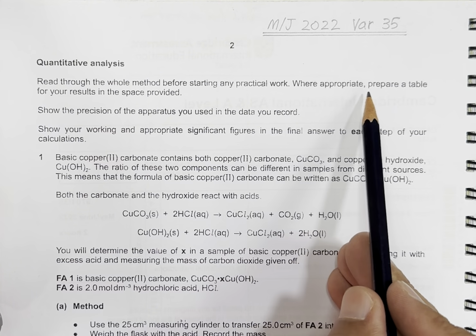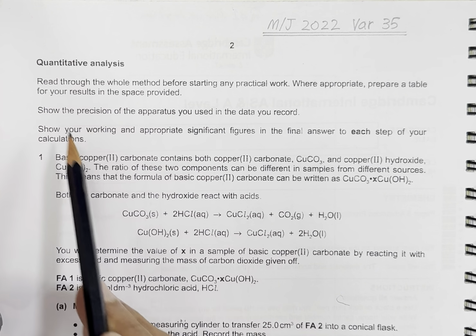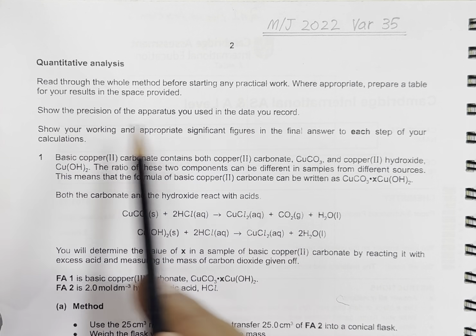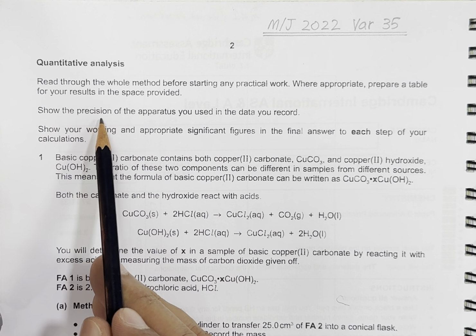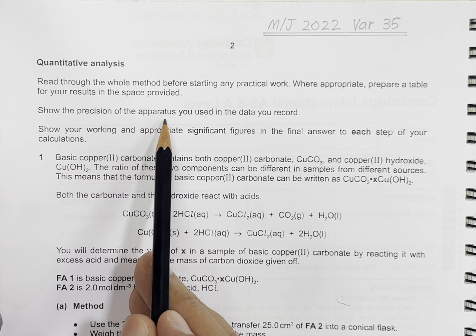Where appropriate, prepare a table for your results in the space provided. Show the precision of the apparatus you used in the data you record. Now, the precision means you have to record every observation, every volume, every mass, every temperature, up to the error of the device. It is called the precision of the apparatus.